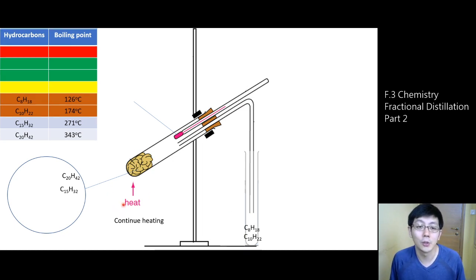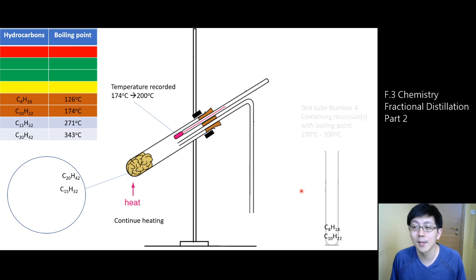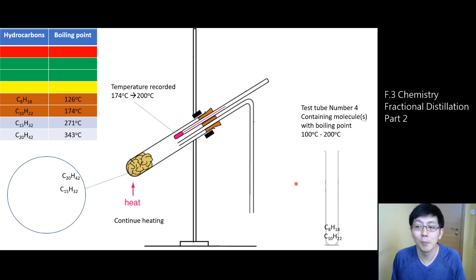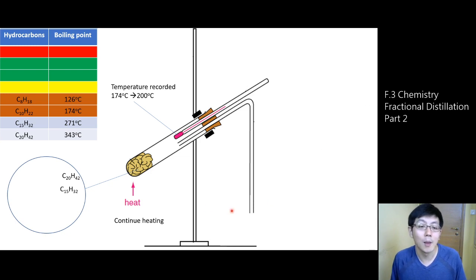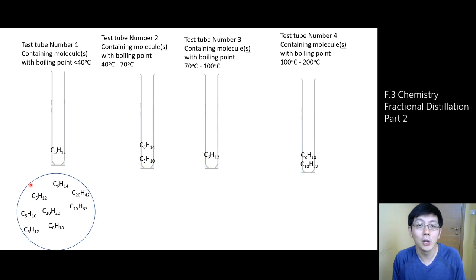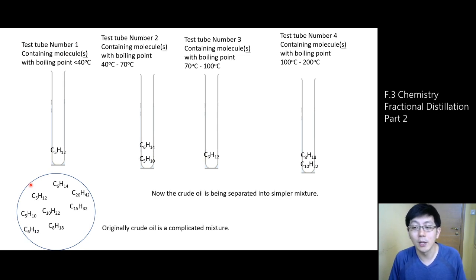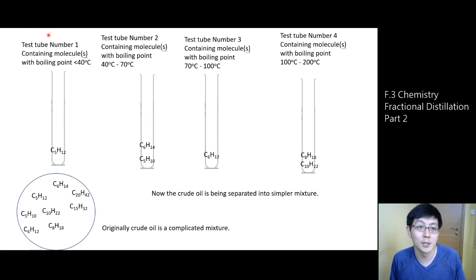If heating continues and the temperature reaches 200 degrees Celsius, we remove the test tube and label it — maybe number 4. This test tube will contain all the hydrocarbons with a boiling point range between 100 and 200 degrees Celsius. We remove this test tube, cap it, and continue the process. By continuing this process, we can separate crude oil into simpler mixtures. Originally the crude oil contains many different types of hydrocarbons; now we can separate them into test tubes 1, 2, 3, 4, each containing hydrocarbons with a definite boiling point range.